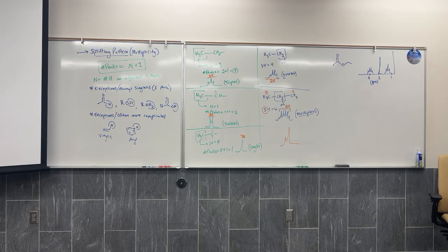So where are you guys at? What are you thinking? Which one was our other CH? Do you know which one that belongs to? That would be the singlet. Only hydrogens show up, so this is the methyl CH3, and it has no neighbors because these two hydrogens are just adjacent. Do you count those two? No, it's just adjacent. So the chemical shift helps you. This guy's gonna be five, that guy's gonna be six, and the splitting pattern confirms it. That has 2H, so that's probably three neighbors, a multiplet. Which one are you calling a multiplet? The middle one? Perfect.